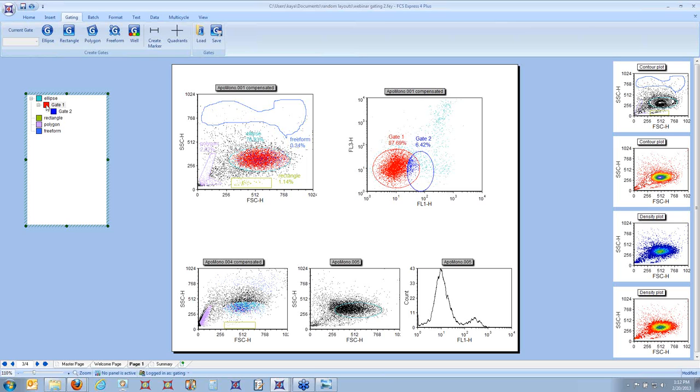You can even do things like rename your gate. So I'm going to just click on that gate 1, press F2 on my keyboard, which is a normal, regular rename command in Windows, and I'm going to rename this to be called my red gate. Okay? So now it's called my red gate. You can see that the gate text box automatically updated. All right. So I'm actually just going to drag gate 2 so that now they're at the same level again.